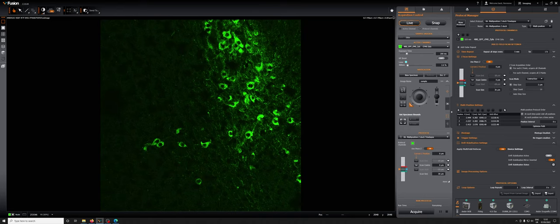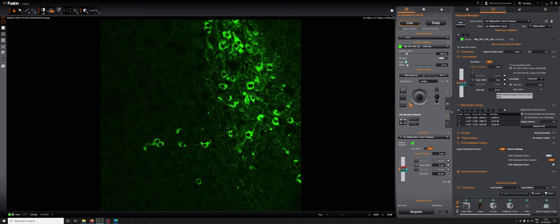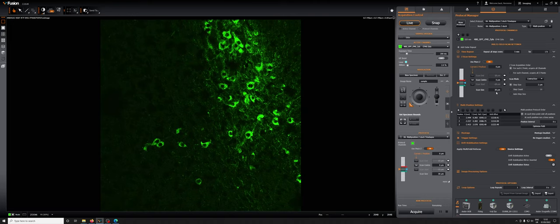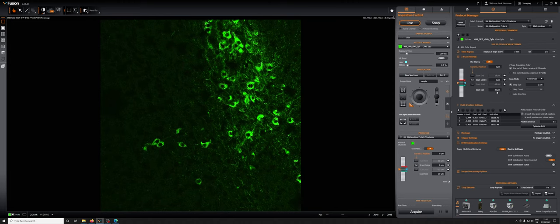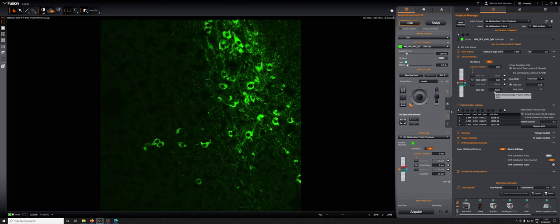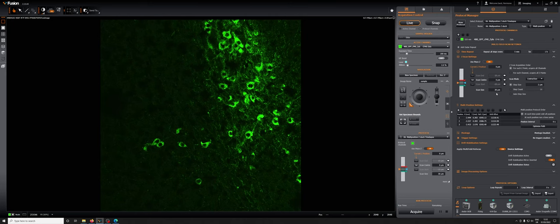One last comment: if you want to change the scan size after you've added these points or after you've added some of these points, you can do that and it will work just fine. For example, if we had realized that 20 was not going to work only after adding the third point, we could switch it then from 20 to 30, and all of those points will be acquired with a scan size of 30.